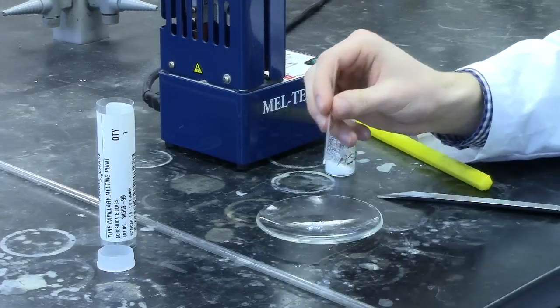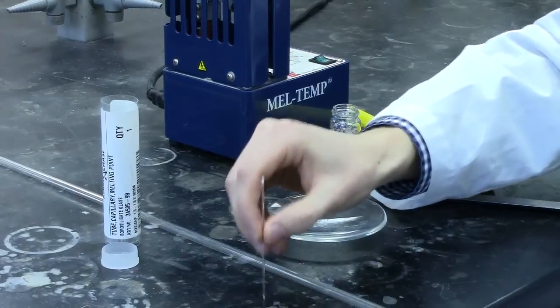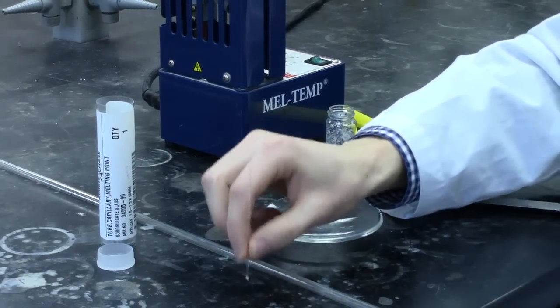Once you have some of the fine sample in the end of your tube, you'll gently tap it on the bench to bring it down into the bulb of the capillary tube.